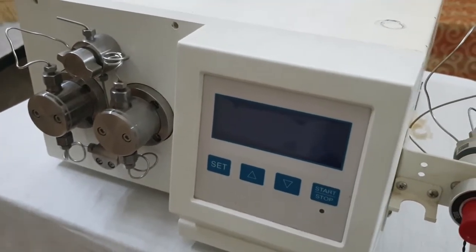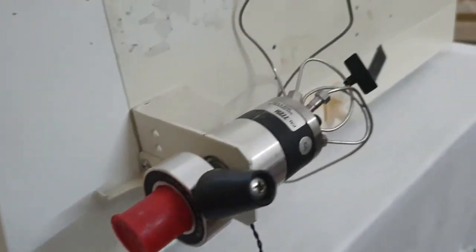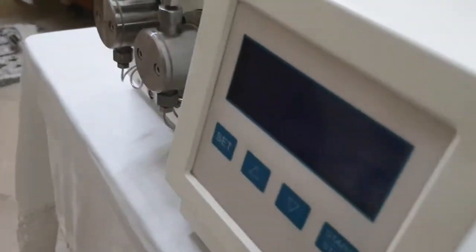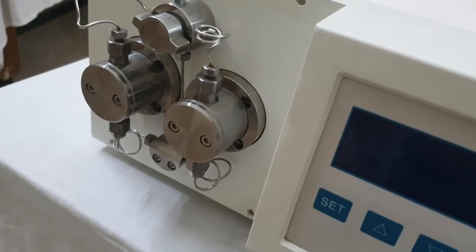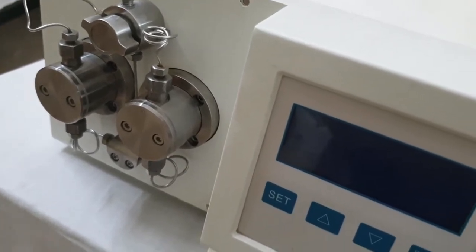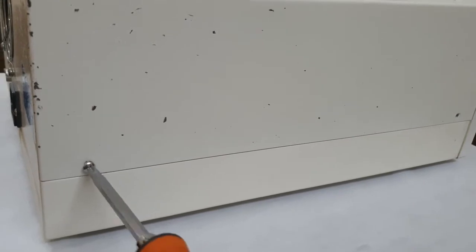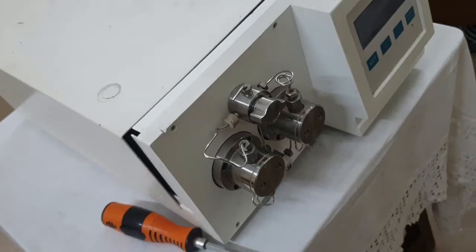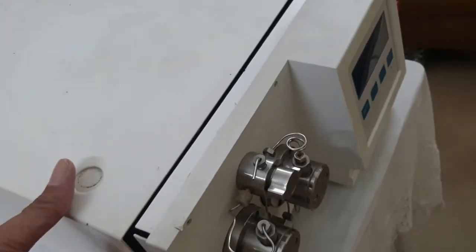To resolve this problem, we will open the cover of this HPLC pump. The pump body has different screws — there is a screw on this point, on this side, and on the other side there are also two screws. We will open these screws first and then open the cover.